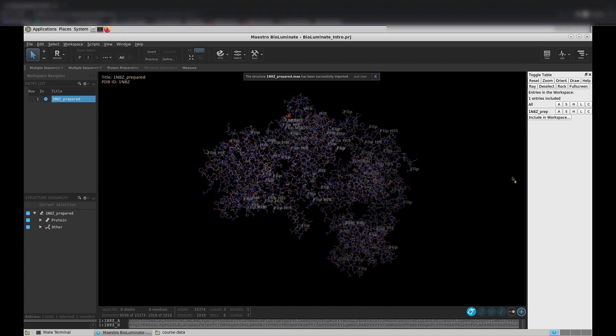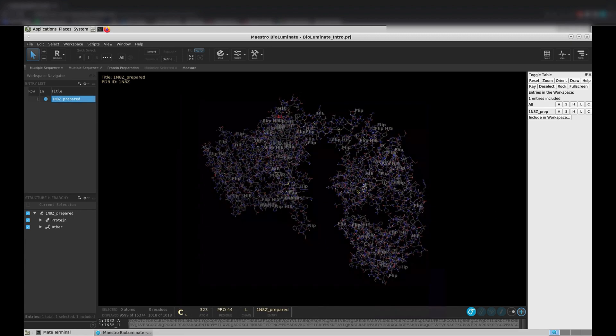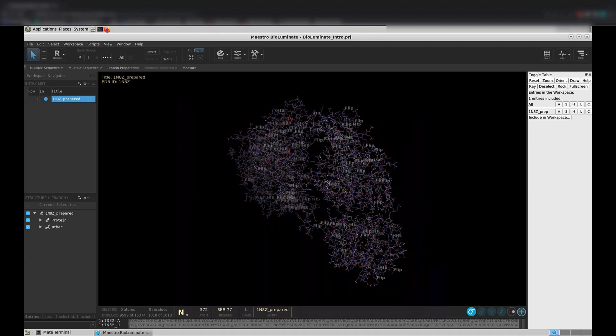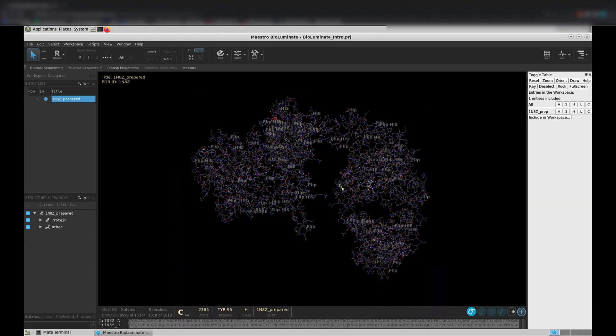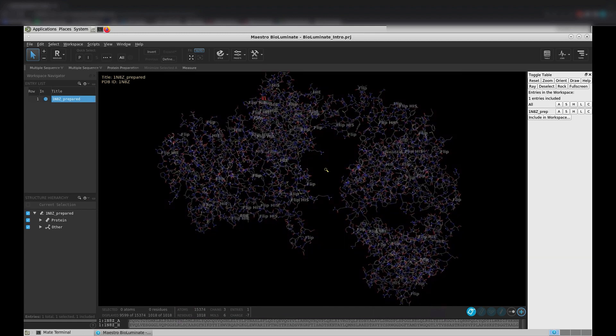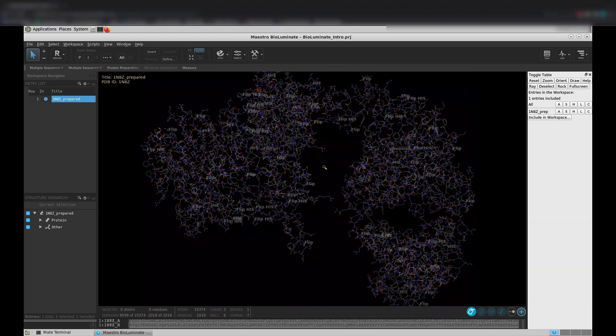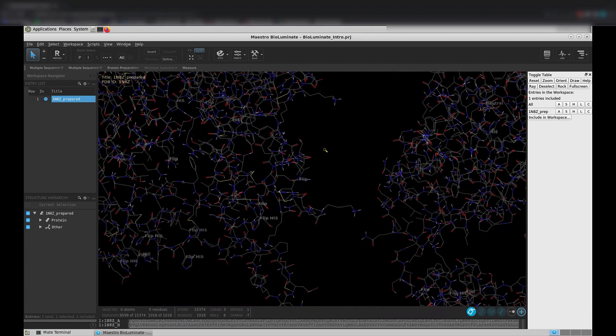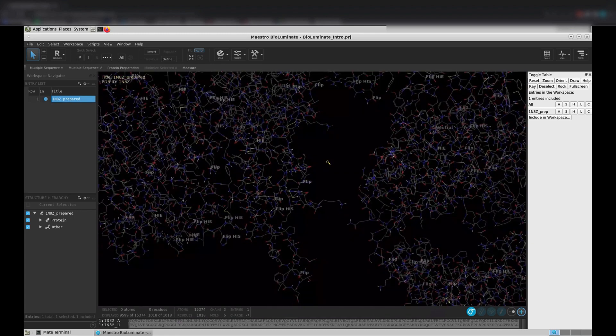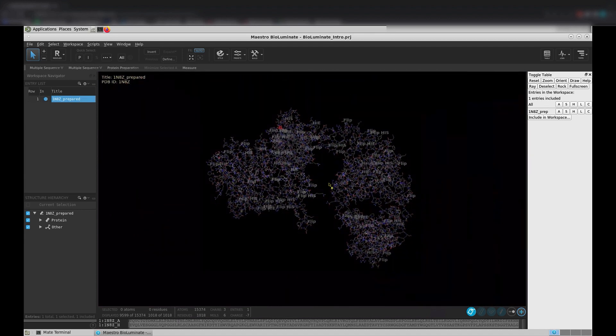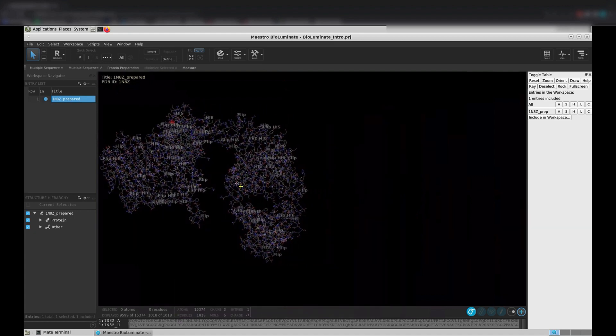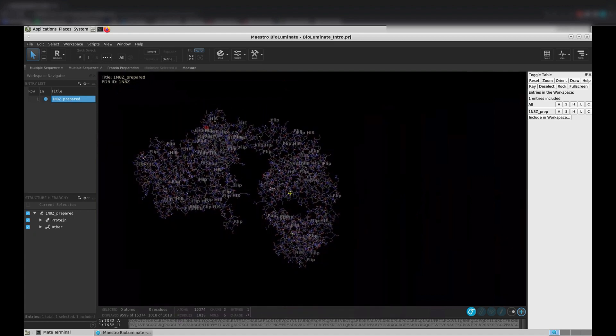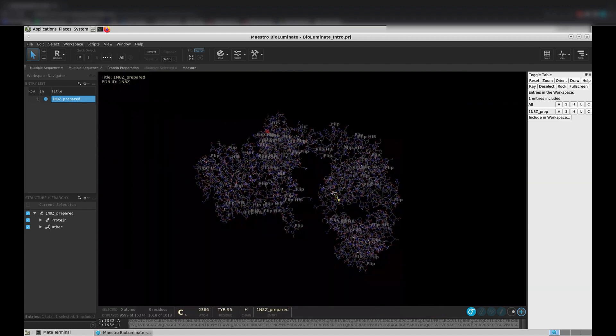Back in Workspace, click and drag on the left mouse button to rotate the structure in the Workspace. Next, use the right mouse button to zoom in and out. Take a second to get used to these motions. Now, click and drag your scroll wheel. This translates the structure in the XY plane.